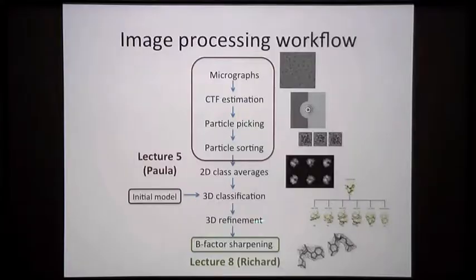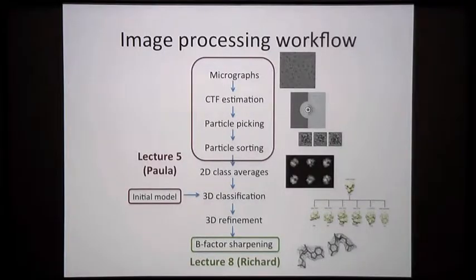After what I will be discussing, there will be another lecture about how you do some post-processing on your refined maps. And then after that, there will be interpretation as well by Leifu and Alan, sorry. But today we'll do two-dimensional and three-dimensional image refinement, which could be alignment and classification both at the same time.